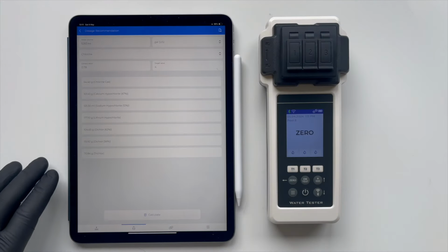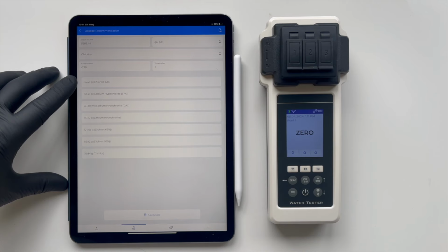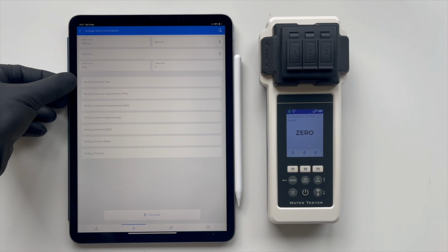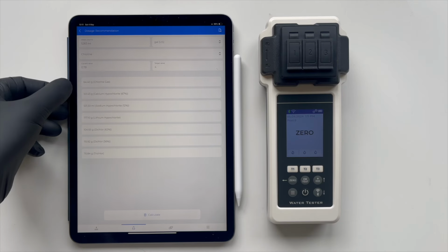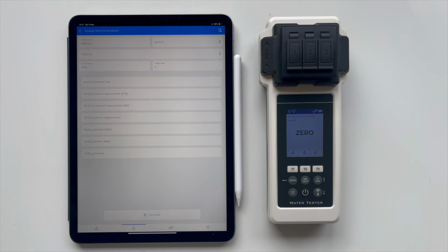Keep in mind that we have entered a wide variety of chemical products into the system. This extensive list reflects the diverse range of treatments available to address different needs within water chemistry management. Although our database includes numerous options to cater to various scenarios, in practice, you might typically use just one or a few specific brands regularly. It's sufficient to enter only the brand you typically use, as this simplifies management while still meeting your requirements.